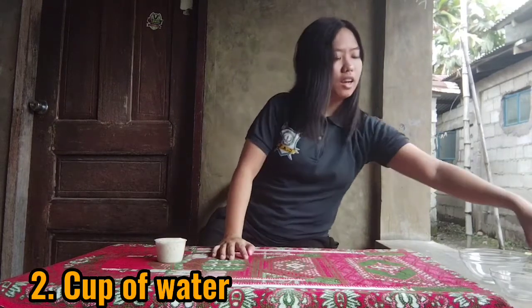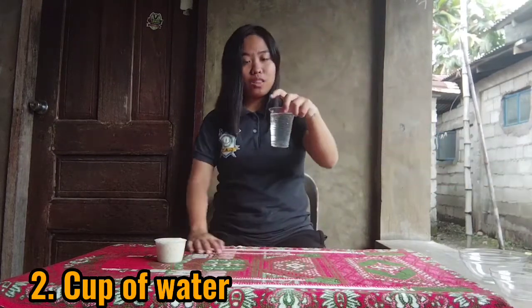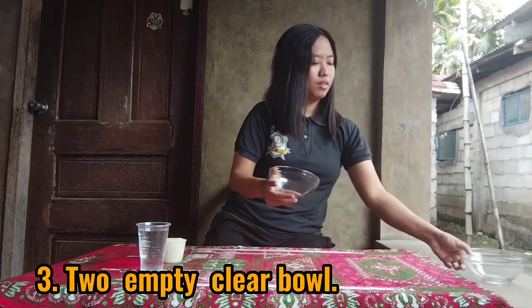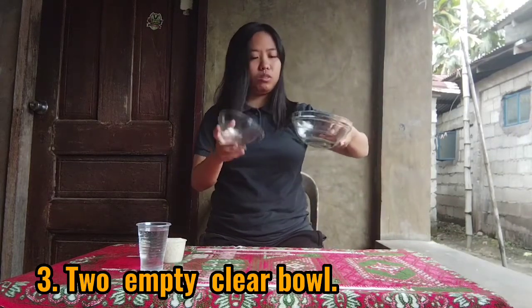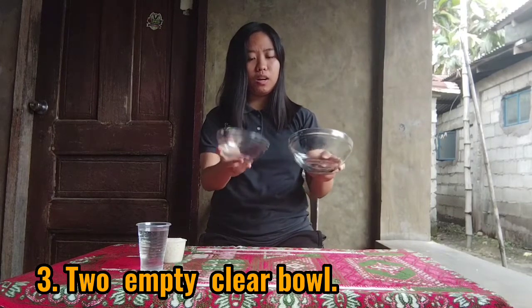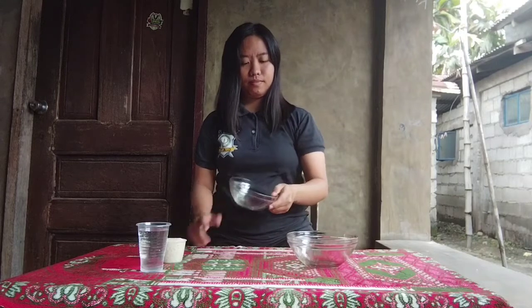Second one is a cup of water. Third one is a bowl, a clear bowl, a small one and a big one. And now, let's proceed.